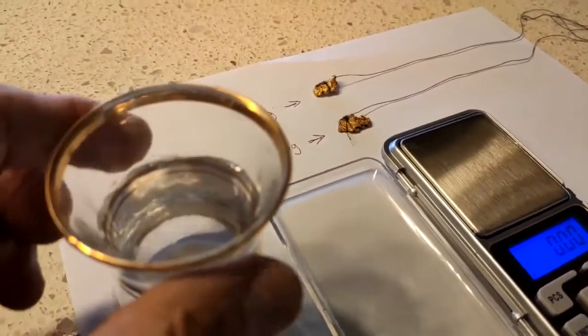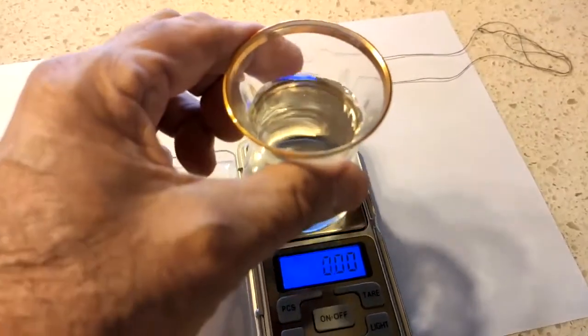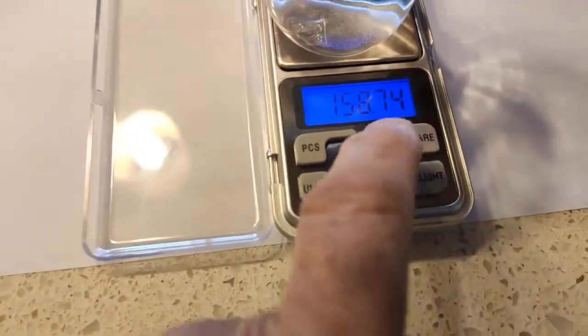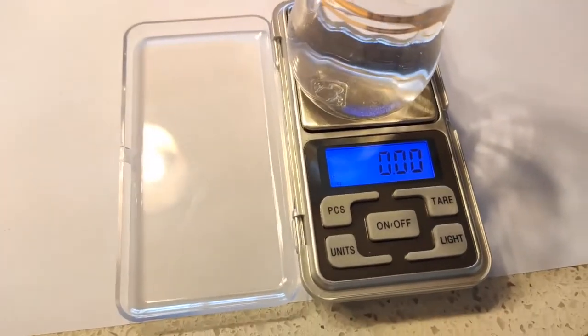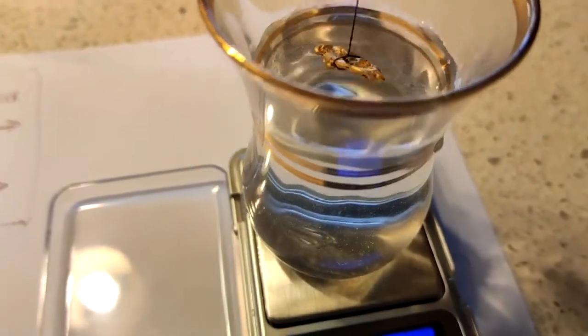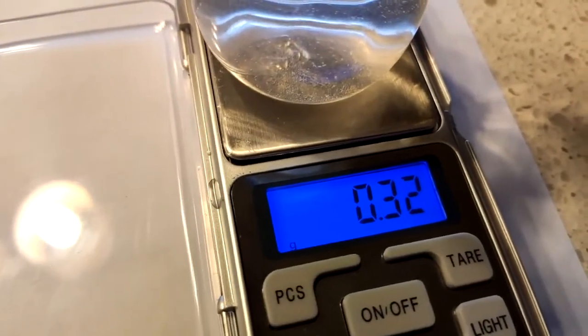Take the beaker of water and put it on the scale, then zero out the scale. I do this by turning it off and back on and it should go to zero. Then pick up your first piece of gold and lower it into the water. Be careful not to lower it all the way to the bottom.